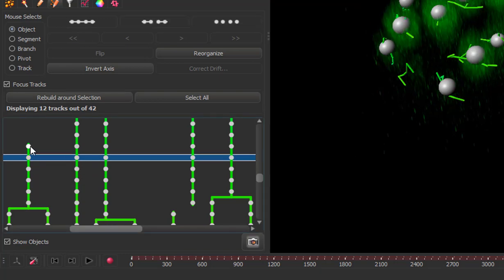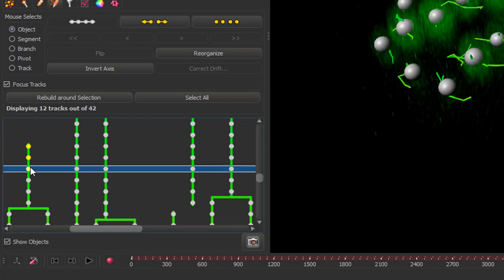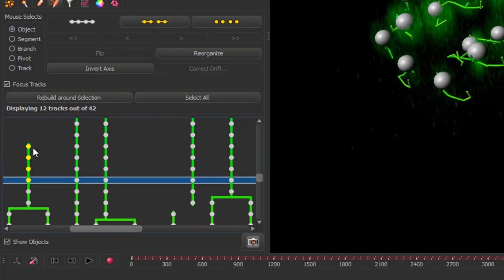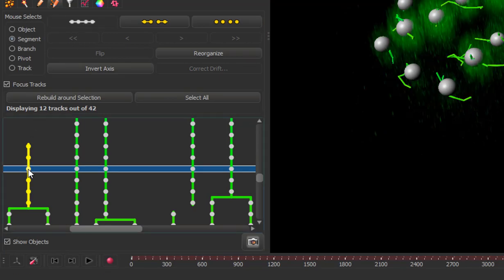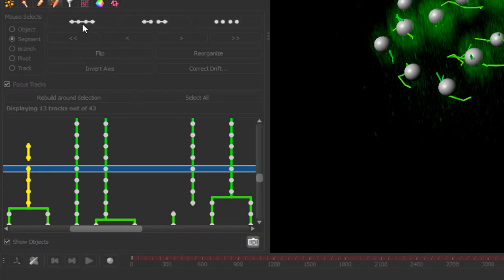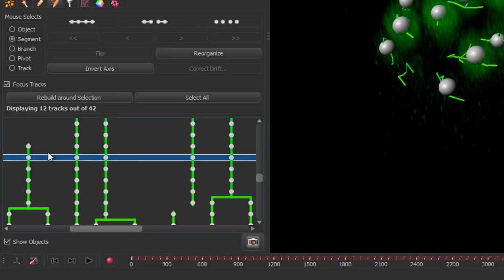You can select more than two objects, Ctrl left, Segment, or Track, and then you have two options. You can disconnect all objects to break all the links between selected objects, or disconnect selected objects at current time point, which breaks the track only between current and previous frame. You can revert both operations by clicking Connect if the objects are still highlighted in yellow.